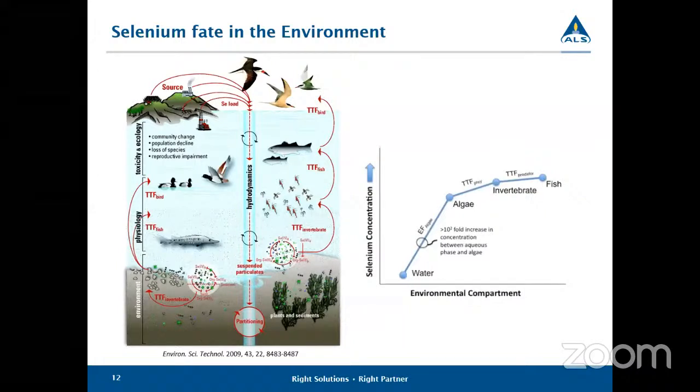Okay, in mine wastewater, other metals may be very high, such as iron. Have you had problems with interference of other metals, making it challenging to quantify selenium species? Not on the species. The system separates out all the species. It's pretty robust. We can run from seawaters to clean waters. Biotas are the most complicated of matrices.